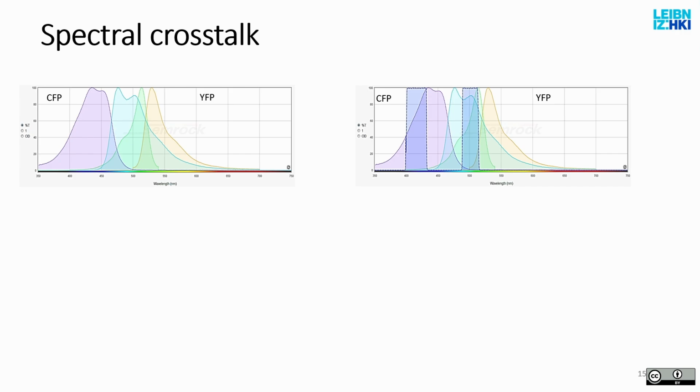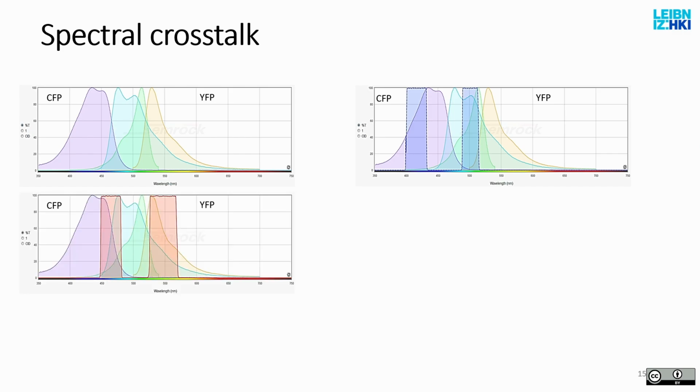The problem then comes on the emission spectra, which unavoidably overlap quite a bit. And then you have a problem. You can, of course, set up your emission filters. And this actually is important even in laser scanning confocal microscopy, because the lasers are monochromatic, but the emission is, of course, not. For example, like this.